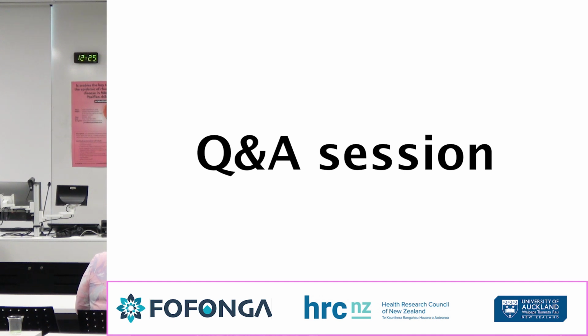For the qPCR at the moment, they're starting to set it up at Simon's collaborators at Victoria University of Wellington, where some molecular biologists are working with us on the qPCR, just to take the pressure off Cielo a little bit. Cielo is really the leading light with the digital PCR, and she developed the qPCR method as well.